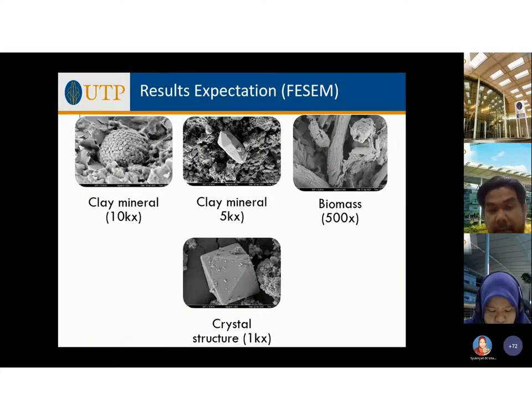This sample must be coated with gold before we put it in the FESEM chamber. If not, we cannot get an image as clear as this.